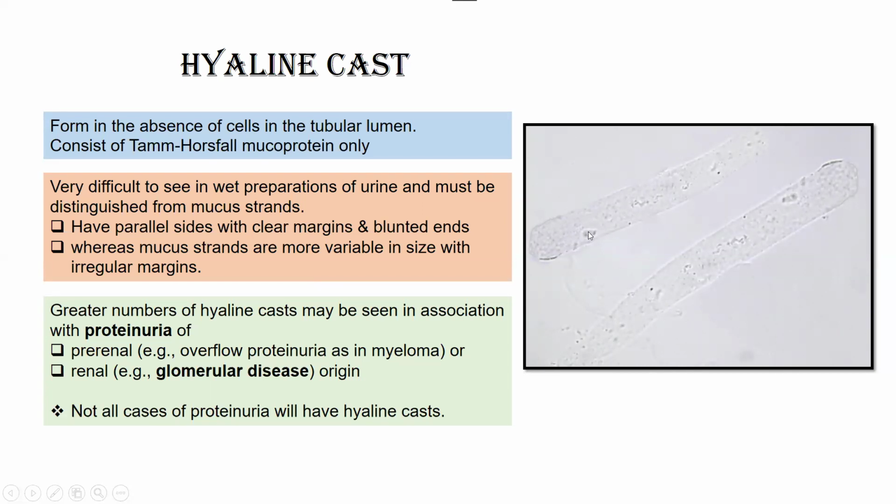Basically, it's a type of preparation in which you put your liquid sample onto the slide and you view it under the microscope while it is wet. We do not dry it or fix it like we do in some other slide preparation methods, where we pour our liquid sample on the slide, fix it, stain it, dry it, and then view it. No. In wet preparations, we have the liquid sample on our slide and we directly view it under the microscope. And that's why in wet preparations of urine samples, hyaline casts are very difficult to view.